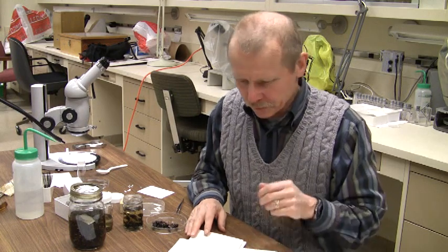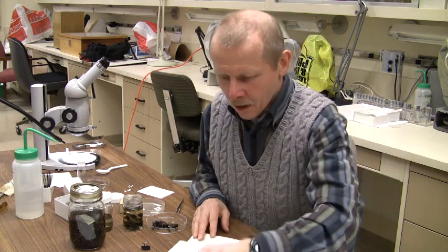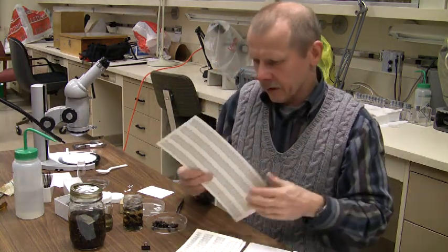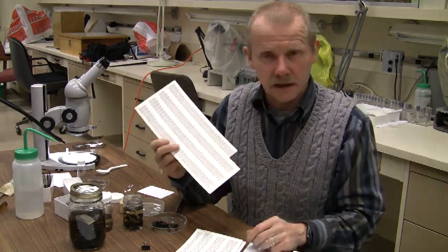I'm going to take a few minutes this afternoon to introduce you to some of the techniques that you'll need to put together your individual insect collection. What you'll have in front of you on your desk is a piece of heavy paper with insect labels.